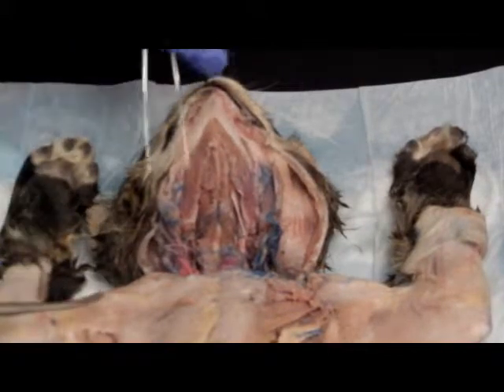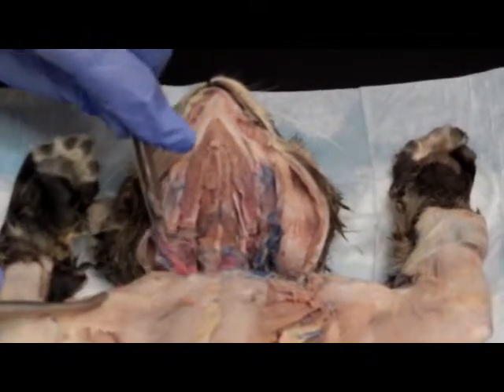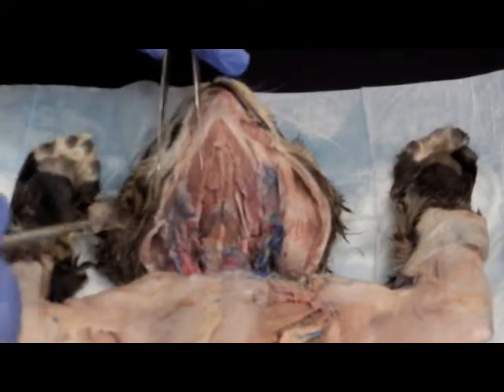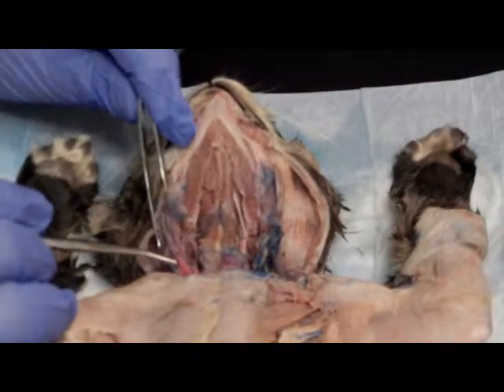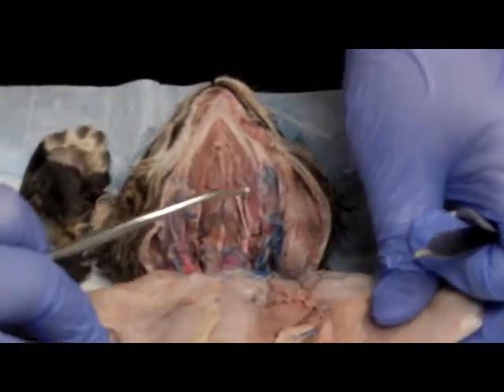And the clavotrapezius, this right here. The origin is the lambdoidal crest of the skull, and the insertion is the clavicle, and it draws the shoulders upward like in shrugging.